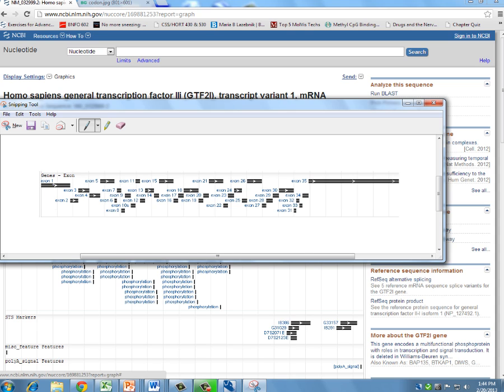So you'll just say it contains the following exons, colon, and then list the numbers 1, 2, 3, 4, 5, and you'll notice that some of the numbers are missing because those exons were not included in this mRNA isoform.